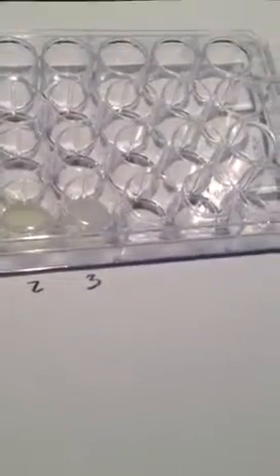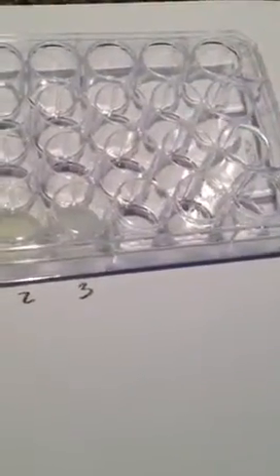So this Lab 7 is for reaction order and rate laws, and I just finished mixing my chemicals. I have my distilled water, my sodium thiosulfate, and then my hydrochloric acid. This was for my data table 2, so I was verifying the concentration of 0.3 moles of that sodium thiosulfate.